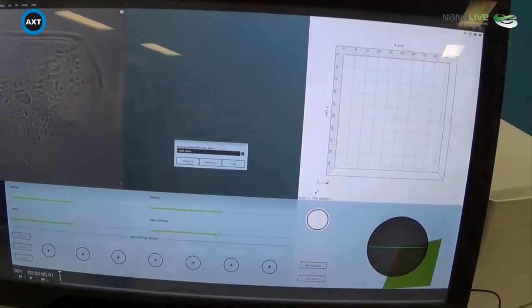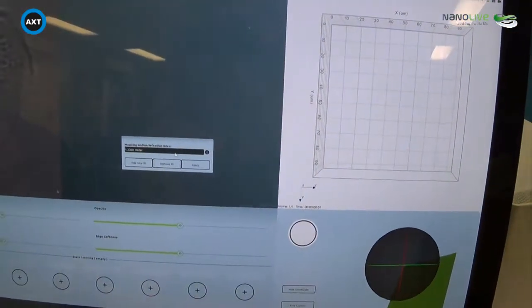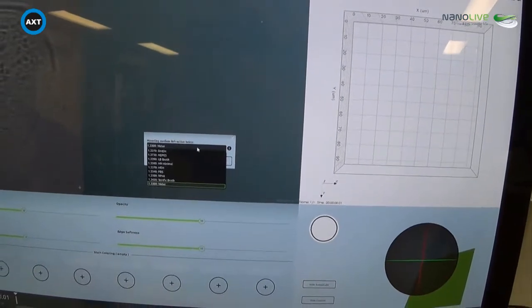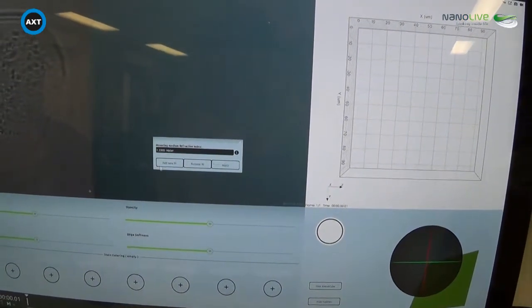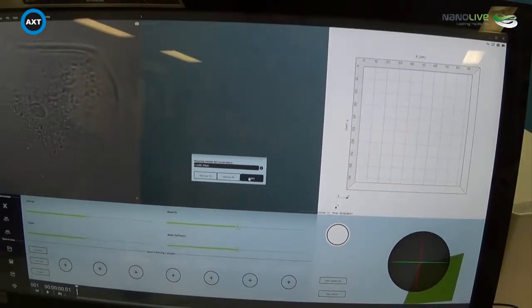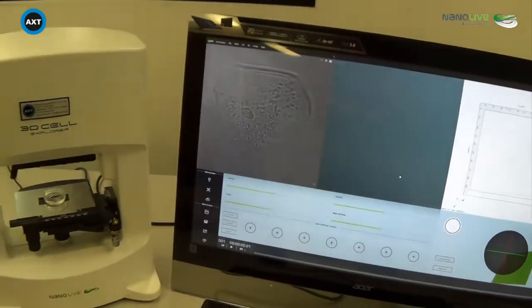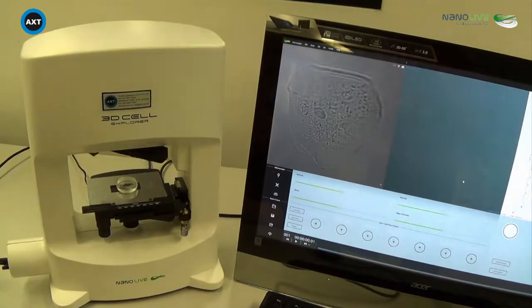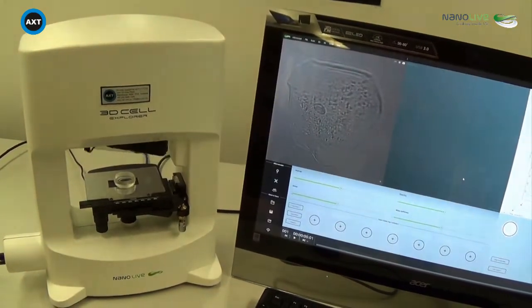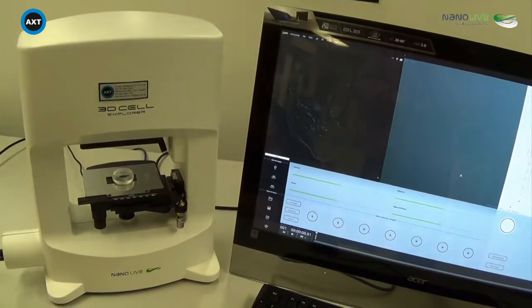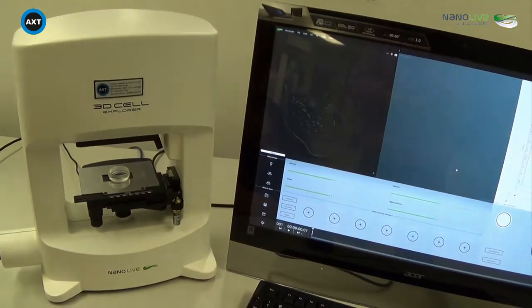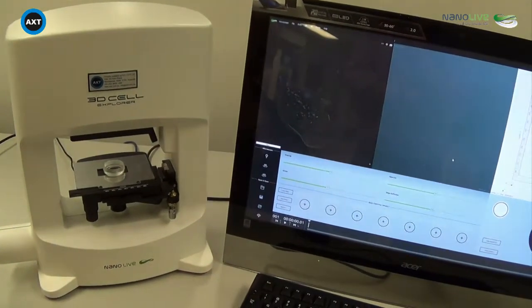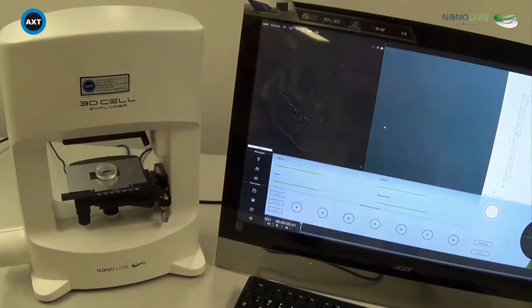If you have other media that don't exist in this list, then it's quite simple to add a new one based on its refractive index. So if I hit the apply button, then the 3D Cell Explorer does its 3D acquisition. It's using holographic tomography, spinning and capturing 100 holograms during its spin in order to measure the refractive indices of all the various components of the cell.